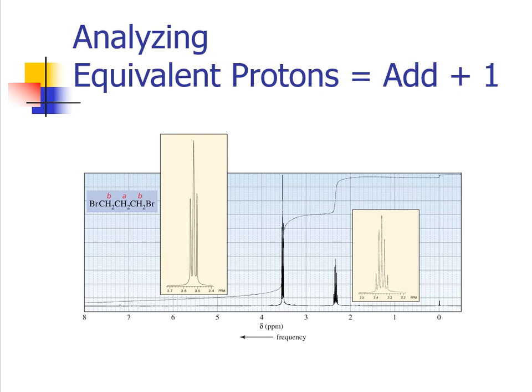So here we get an NMR, and with the diagram that they give us here up in the top left, we see two major signals. We see a signal here in the middle, and we see those two equivalent signals on the end. And then if we look at the signals on the end, which would be B, they are the closest to the electronegativity ones, right? So that means that this is probably further downfield. It has a higher ppm value associated with it.